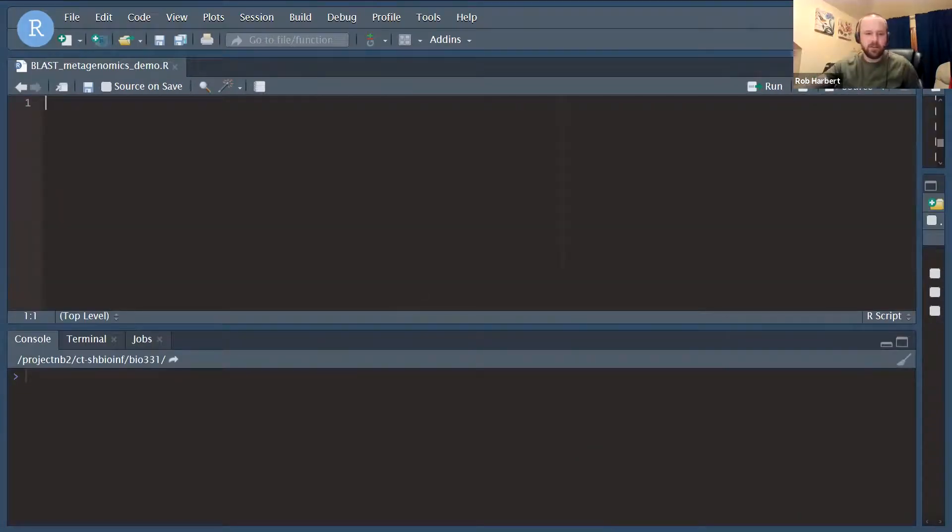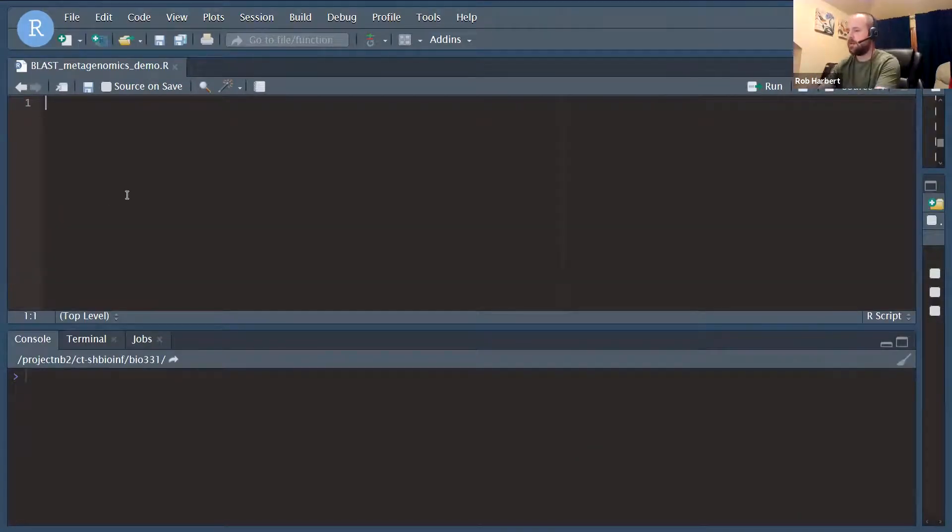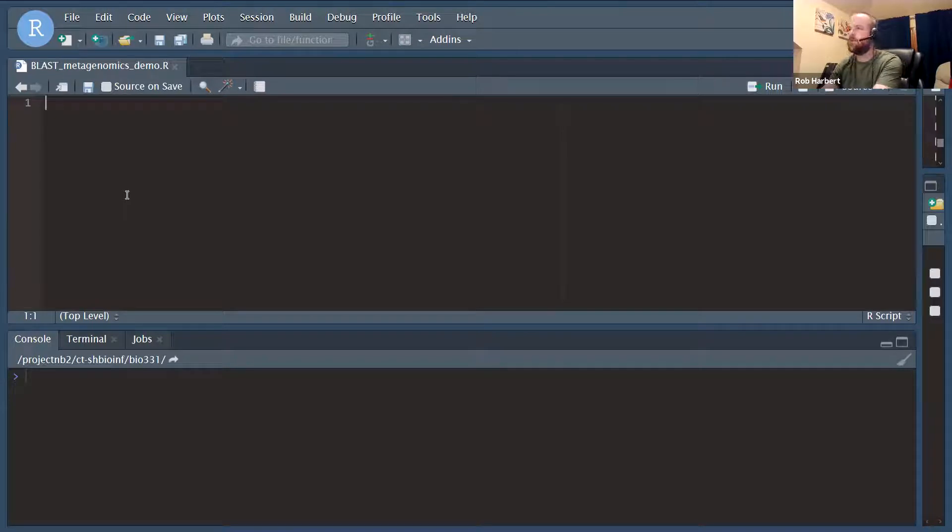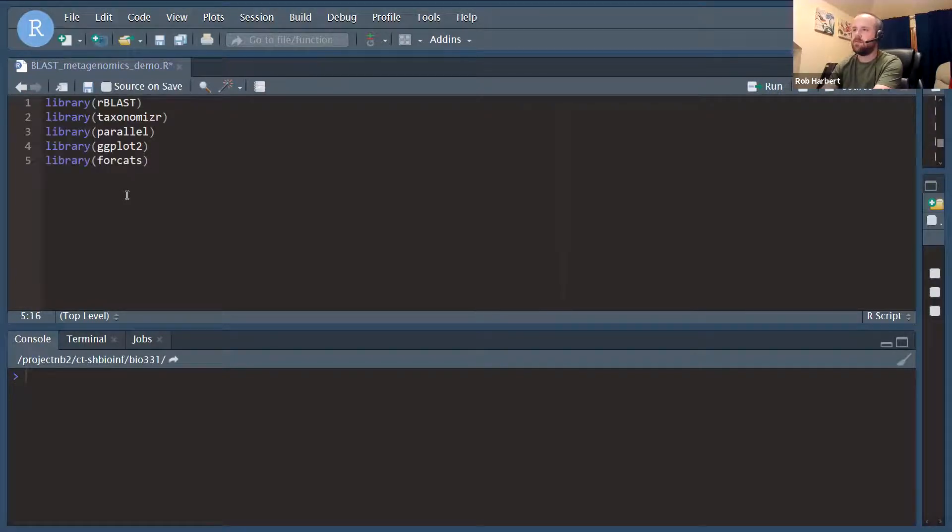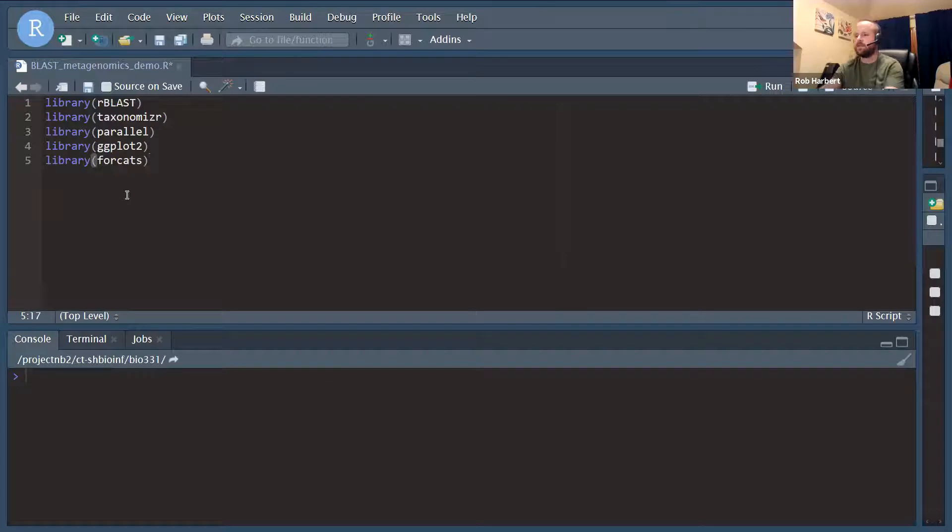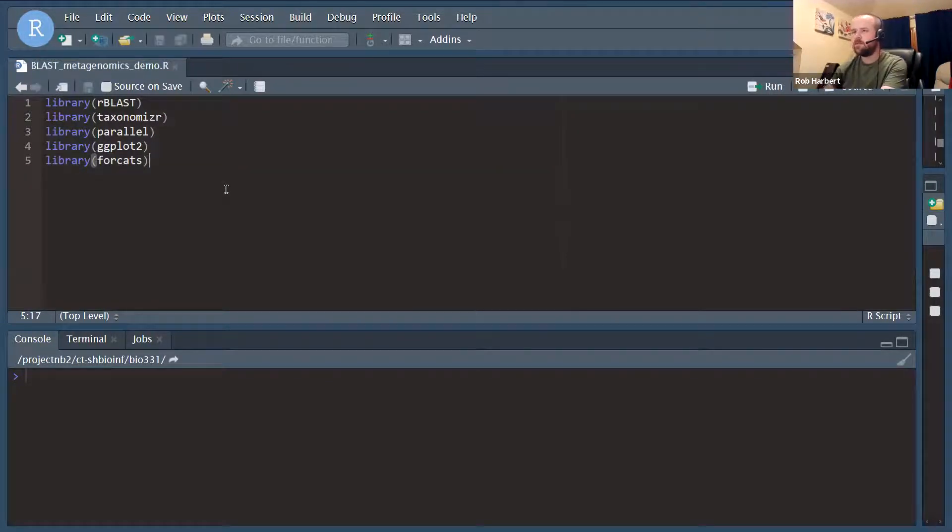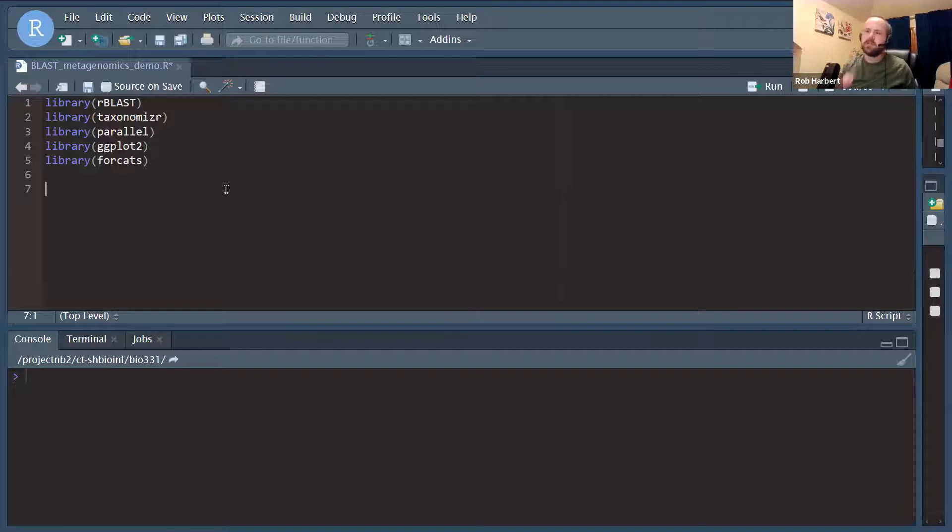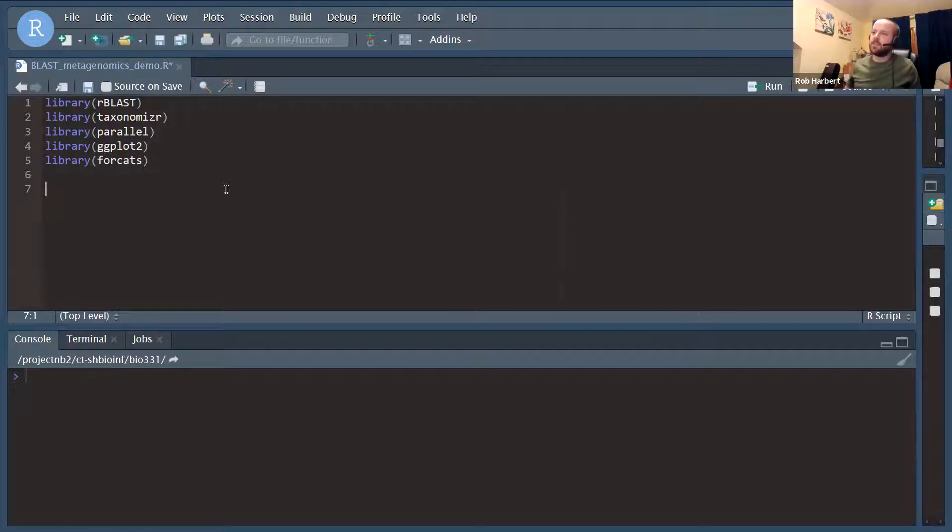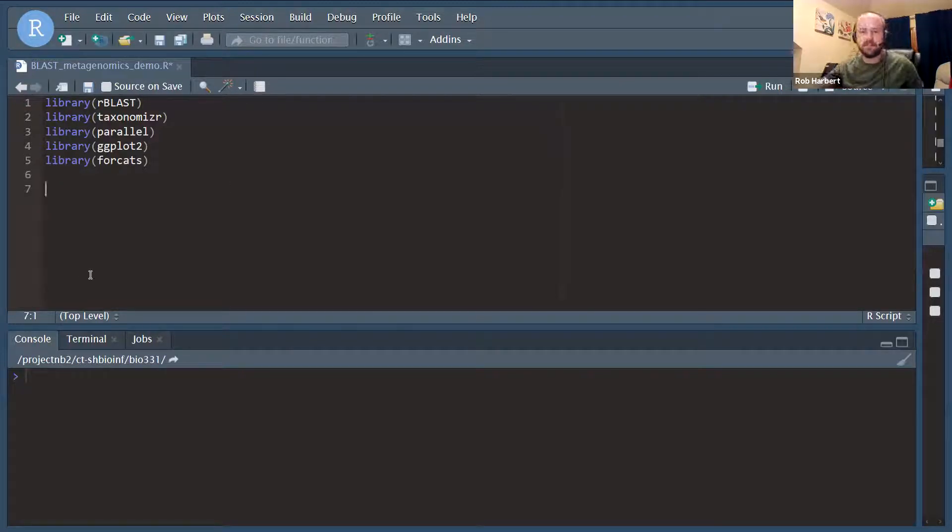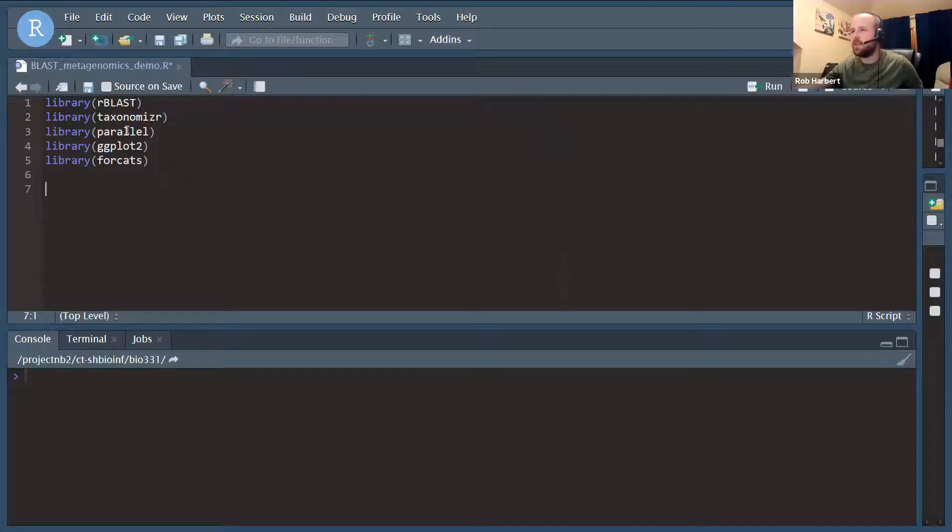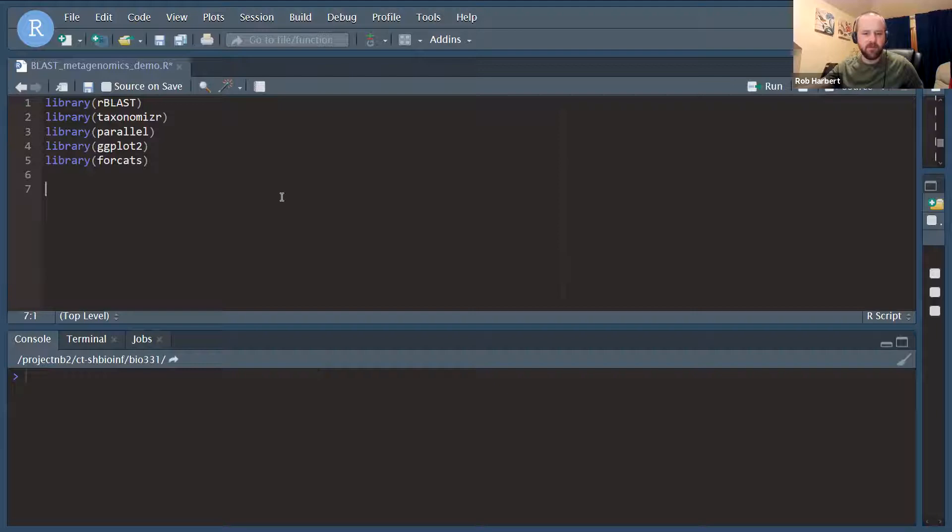We're back here in our studio. We're going to start by loading all of the libraries that we're going to use for this workflow. Our BLAST, of course, is going to take care of our BLAST searches. Taxonomizer is going to give us the tools to look up the taxonomy for every accession in our BLAST hits data, and then Parallel is going to help us speed this up and ggplot and forcats to visualize.